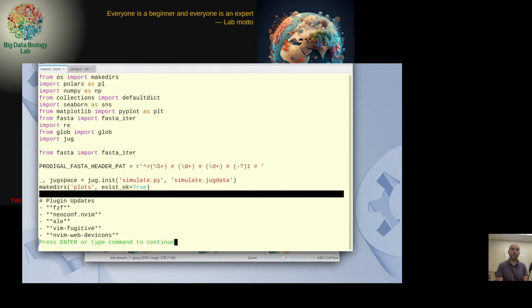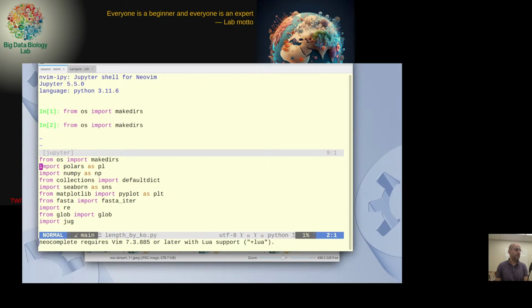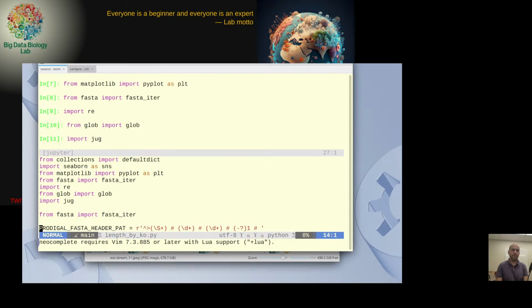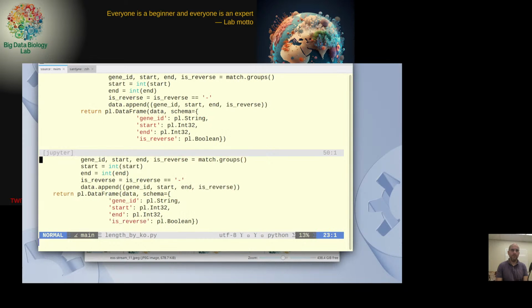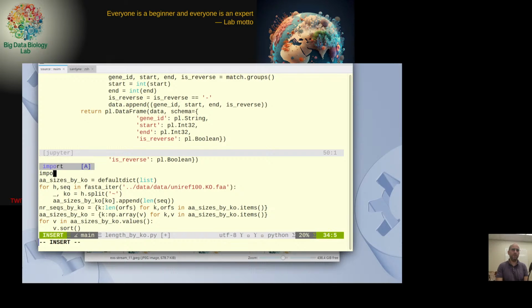The next step would be, so we've been looking at the outputs of actual data. Let's just see what's happening. In the past we used this code to get the reference sizes, but now we want to use the outputs of the GMGC. So let's do that.